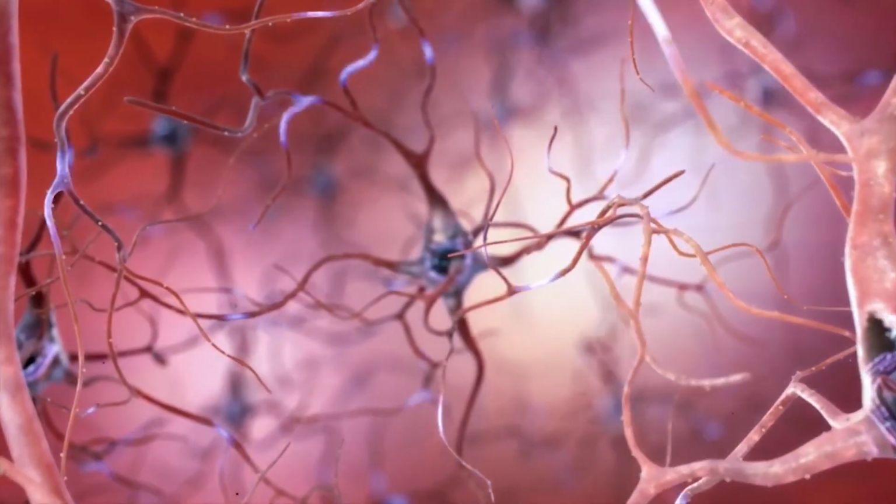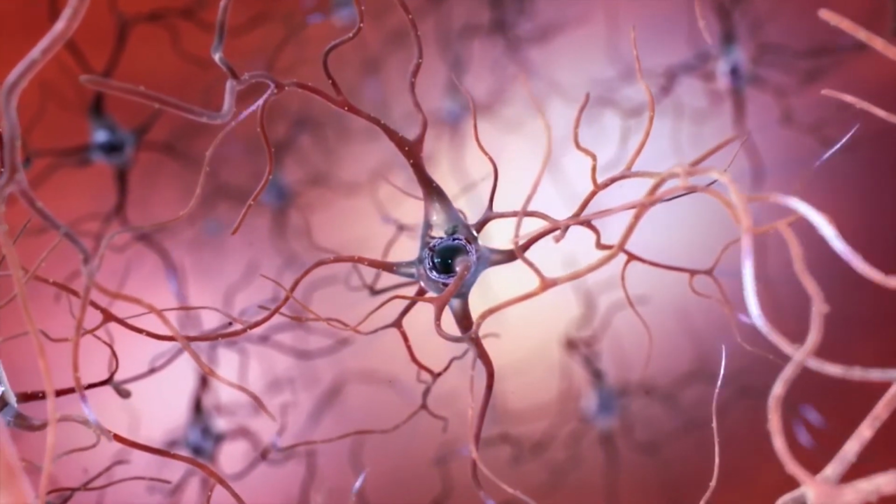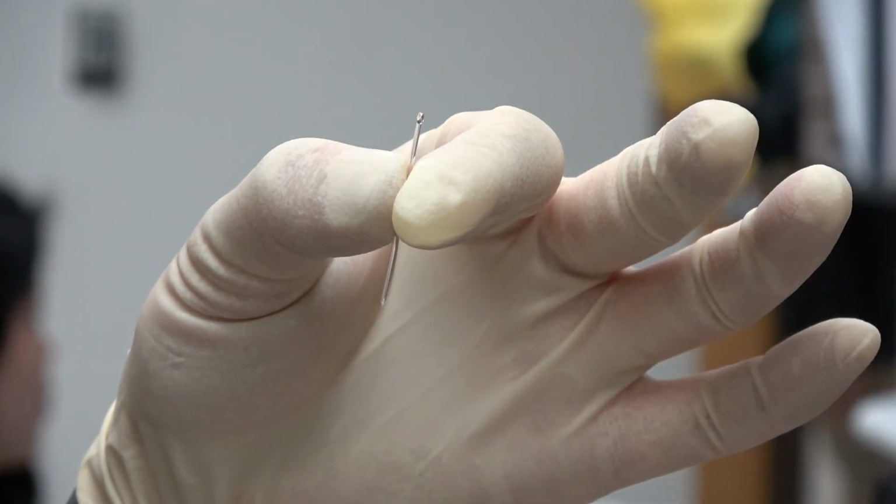And he can accomplish all this in a timely manner because electrophysiology shows him exactly how each peptide affects the nerve cells. There's just one problem. Have you ever seen a nerve cell? They are tiny, usually too small to see without a microscope. So you can imagine why attaching an electrical probe to one would be difficult. Luckily, they can solve this problem with a bit of borrowed knowledge from other biologists.